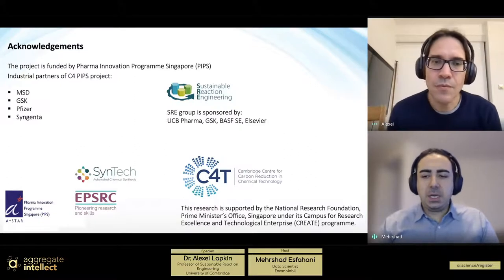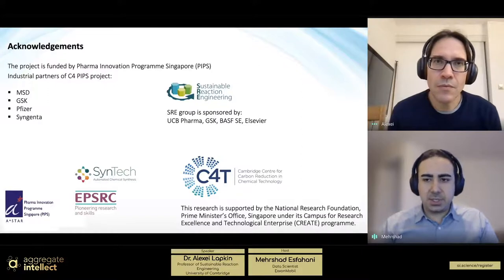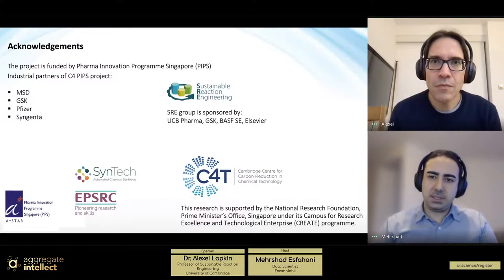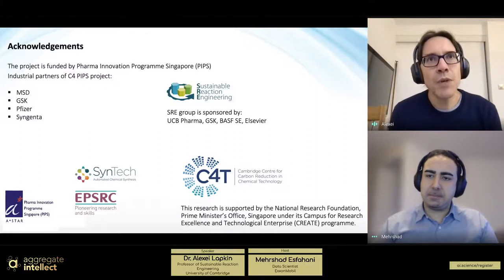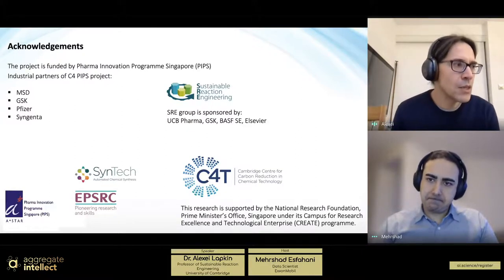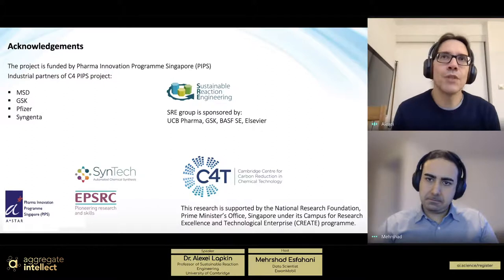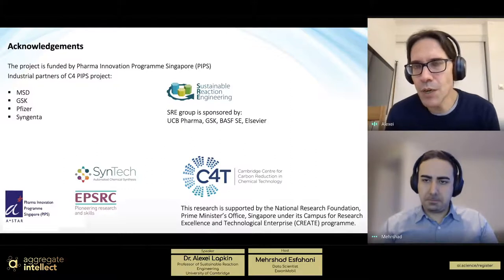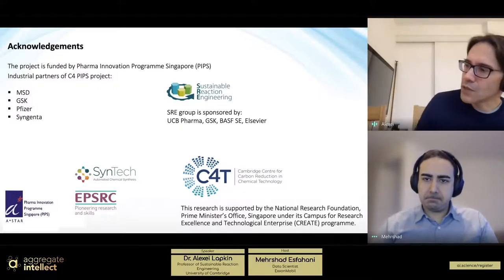Interesting. And finally, for the software that you are using, you showed us the graphical interface for someone who is not familiar with machine learning concepts. Is it commercialized, or if people want to use it or at least work with it, how is the process? Like a license? So the paper with this work is now out. It's open access. The MATLAB version of this algorithm and the interface is published on GitHub for anybody to pick up. But of course, you need to have a MATLAB license to do that.